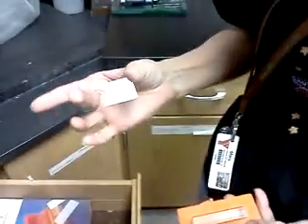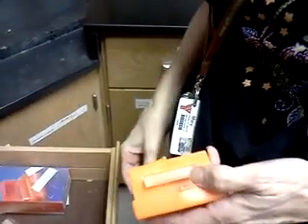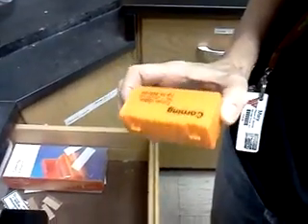Now, he may not want this kind of cover slip, but we get it because it's made like this, and it's especially good for the confocal microscope downstairs, which means you can use it with any microscope. But there are different kinds of cover slips and different needs. It's up to you what you get, but this is what we get. And you definitely should get your own cover slips and slides.